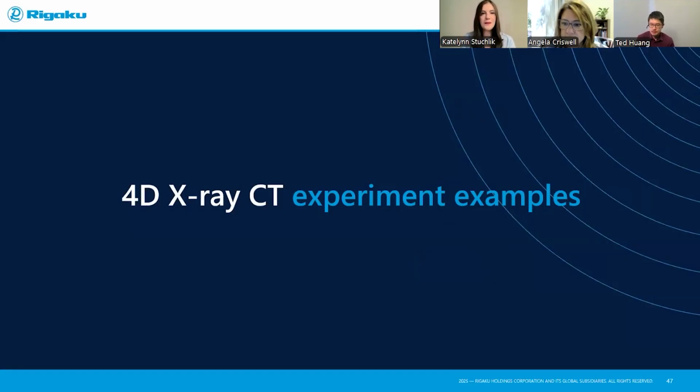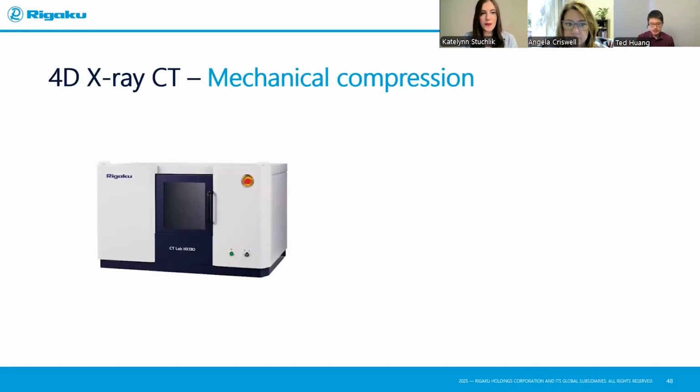And also some of the 4D studies done by my colleague Aya previously. There are some ex situ examples. I feel like that's a good complement to show you both in situ and ex situ capability and what you can do in both cases. So this might not be as interesting as a honeycomb study, but I will tell you step by step the setup and what I'm considering at each step, and what you might also think about when you're trying to do so yourself.